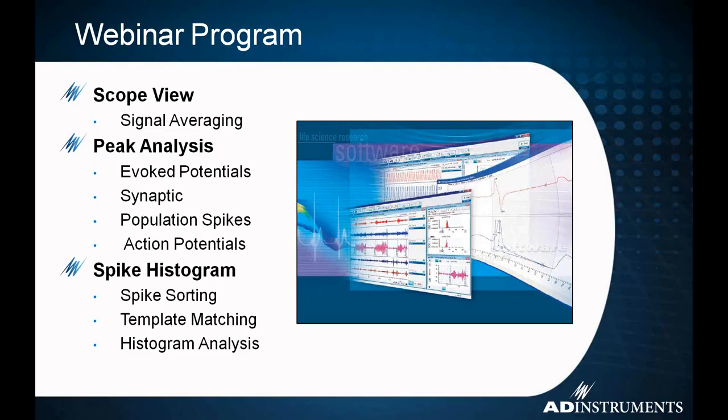We'll also be doing peak analysis and covering a number of the analysis types that peak analysis can do. There are certain changes in peak analysis when you choose these different analysis types, so we want to talk about the differences between them and look at each one individually and get a good understanding of what peak analysis really does. Peak analysis is a general analysis tool that looks at peaks and gives you some information, but each of these types of analysis listed under peak analysis can do something different for you, so we're going to look at that.